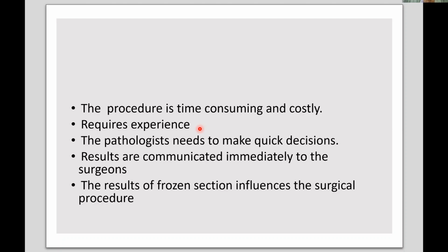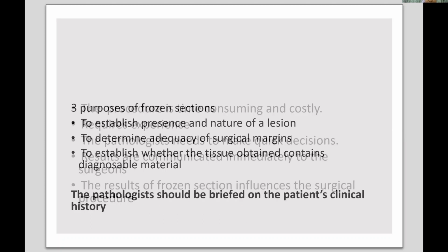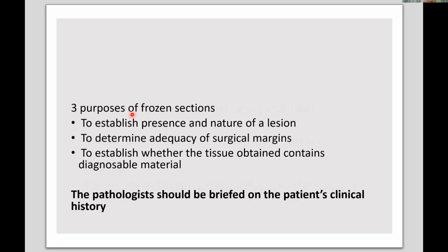Sometimes it's quite difficult, and the pathologist also needs to make a quick decision, because we have a certain period of time to make the diagnosis. For ours, our TAT for frozen section is 1 hour, from the time you send the specimen until the result is given to you. And the result must be communicated immediately to the surgeons, and the result of the frozen section influences the further surgical intervention or treatment.